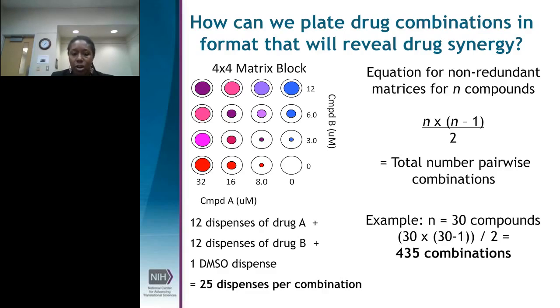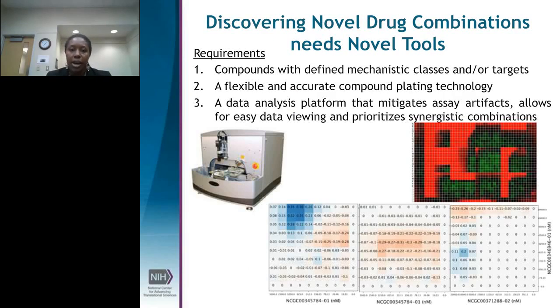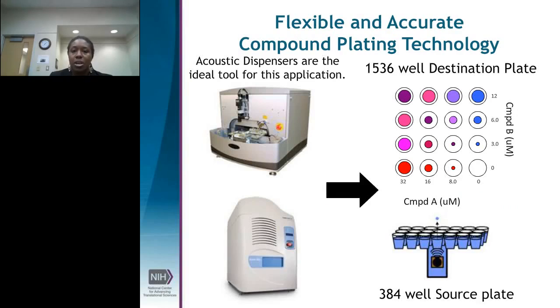And so that is what I'll talk about now, is how we have automated this system using this new technology in acoustic dispensers. Looking at this second bullet point, we need a flexible and accurate compound plating technology. And so that is where acoustic dispensers come in. They are the ideal tool for this application. On this slide on the left, I've pictured 2 acoustic dispensers that are widely used in industry and in various academic institutions. What these instruments do is amazing technology.